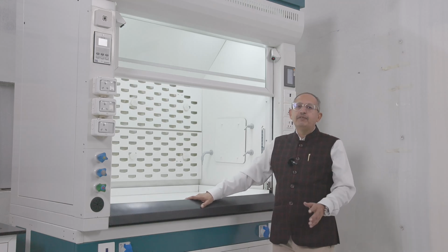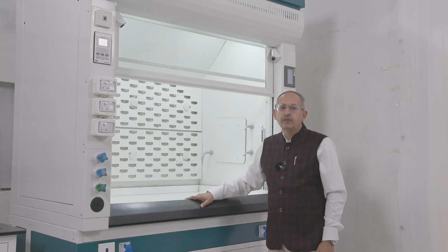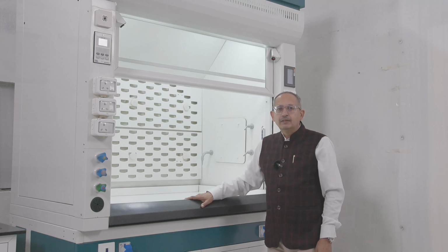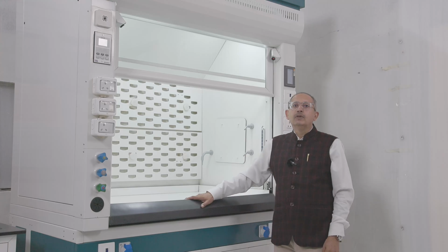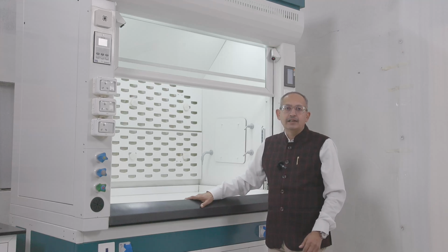Now, I can give a brief about what VAV technology is, what we are using as the auto sash function and how we are making use of the night function. The VAV technology basically works on the principle that we have to adjust the energy intake, or the energy consumed, when the sash is in closed position or when the CFM being used is lower. This makes sure that the fume hood uses only the energy that is required at a given point of time, which makes it energy efficient, and this is how the VAV technology works.